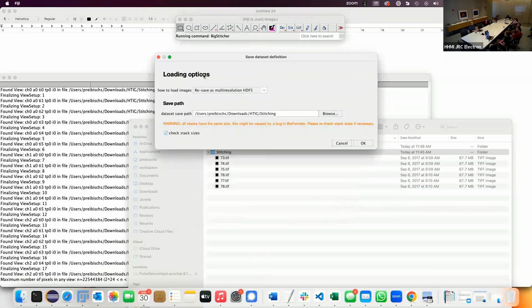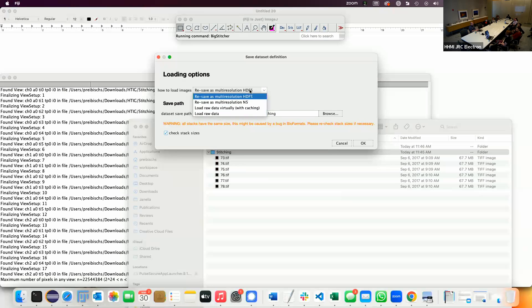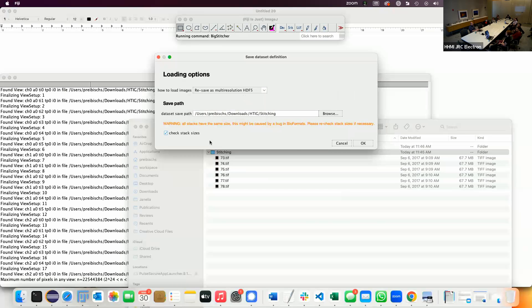Now it goes through all the files and asks: now I understand the dataset — what do you want to do? Do you want to keep it as is and load the data virtually, or do you want to resave it? Typically you want to resave it. If you don't do it on a cluster, HDF5 is usually the right choice — you get smaller block sizes and one HDF5 for everything. There's also a check stack size option — it has to go through all files because sometimes BioFormats assumes certain stack sizes that are just not correct.